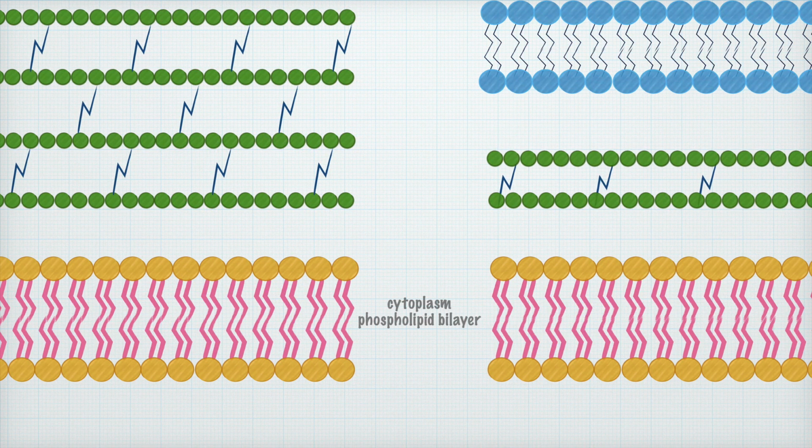So we're taking a look at the different types of bacterial cells that you're looking at under the microscope, and they basically are differentiated by their structure on the outside layer of that bacterial cell. Keep in mind that every cell does have a cytoplasm or a phospholipid bilayer, just like the cells in the human organism. Now, where the bacterial cells differentiate is that, as you can see, there are extra layers on the outside, kind of like a cell wall in a plant.